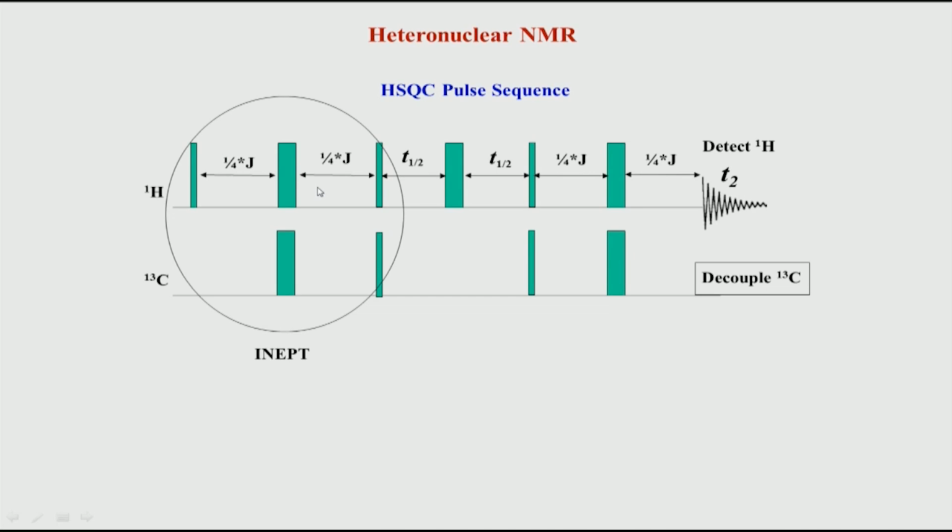This is just technical jargon: an inversion pulse is a 180-degree pulse, and a refocusing pulse is also a 180-degree pulse, but inversion is meant for Z magnetization to be taken to minus Z, whereas refocusing goes from minus X or Y to plus X or Y.